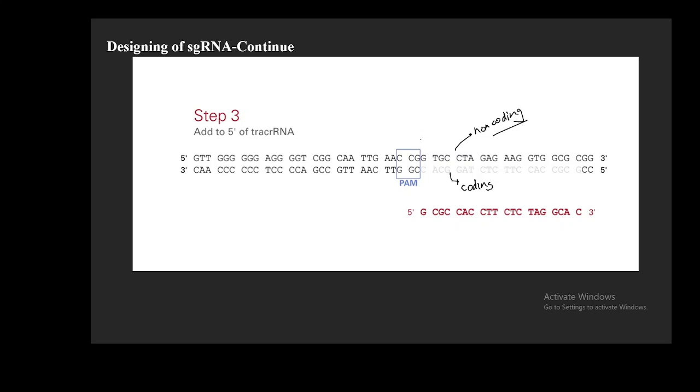So here you can see the sequence is going to be like, if you are taking the complementary sequence to this, you will be having C, A, C, G, G, A, T, C, T, C, T, T, C, then you have C, A, C, then you have C, G, C, and G. Because this is the 3' to 5', when you will order the sequence, you will be ordering G, C, G, C, C, A, C like this.